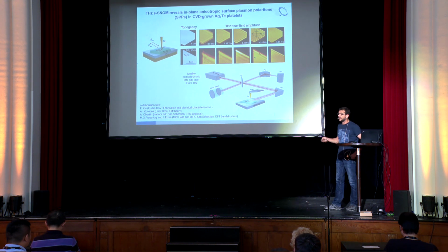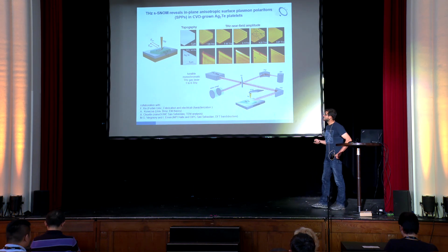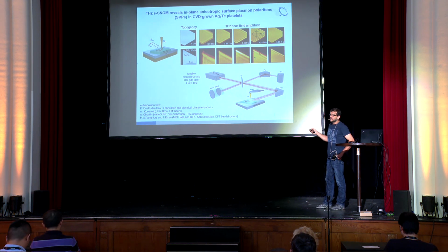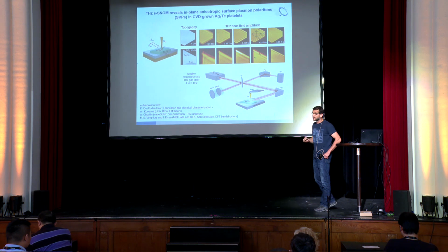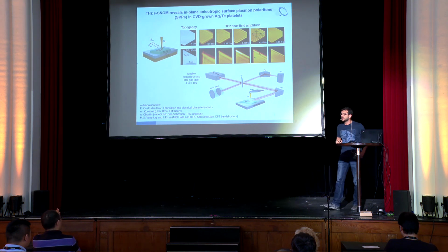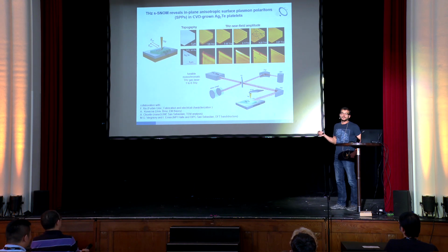We have about 5 lines, up to 100 milliwatts. That's a really powerful laser. There are very few groups who have this type of setups. I have to say this laser was bought once, built by Coherent, but they don't even know anymore that they built it. So I think I'm the only one in the world who has that in combination with an s-SNOM. But in the end, it's very similar to an Edinburgh system, so it's a classical gas laser.